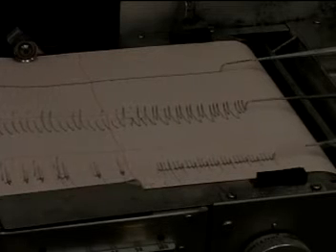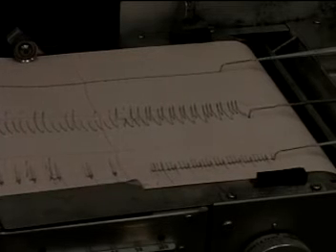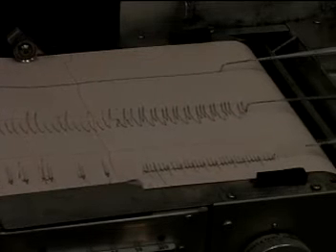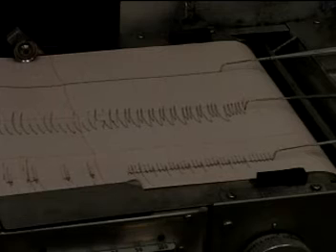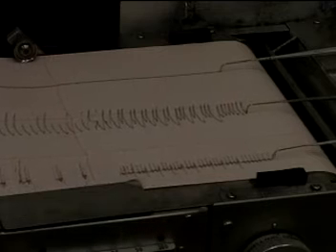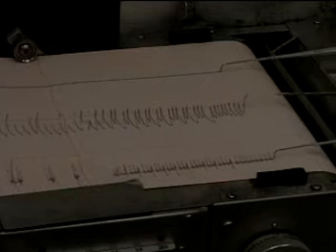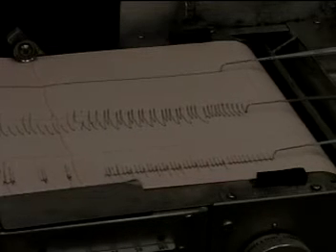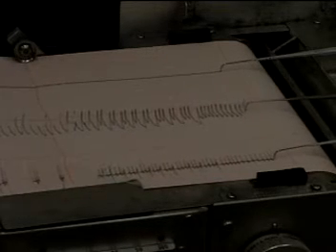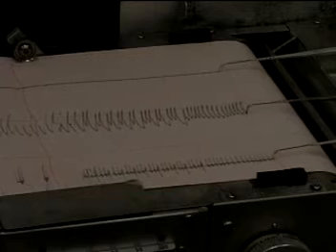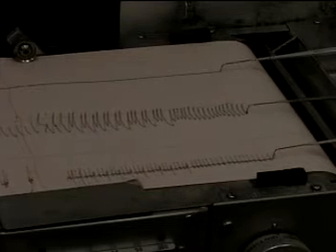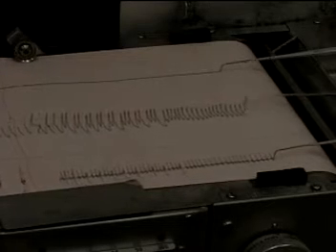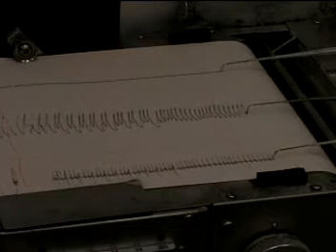This dog is obviously responding to the norepinephrine with a number of abnormalities. You can see looking at the blood pressure tracing you can see doublet heart contractions, but it looks like the response has now returned pretty much to normal.